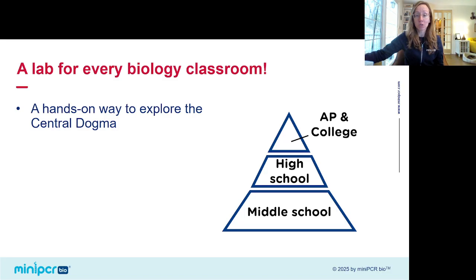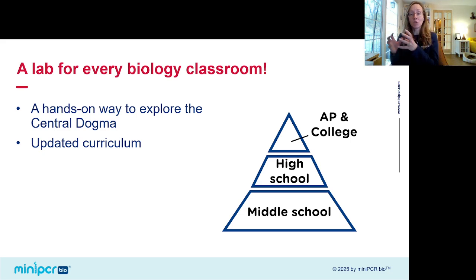We're reintroducing this unique lab to you today because we've recently updated the curriculum. We've expanded it, we've written more of it. We've also broken it up into modules that you can mix and match to tailor this lab better to your students, no matter who they are, whether they're in middle school, high school, or college and beyond.